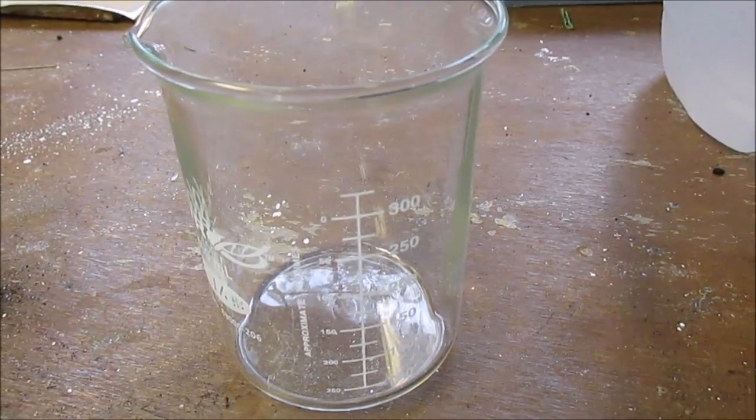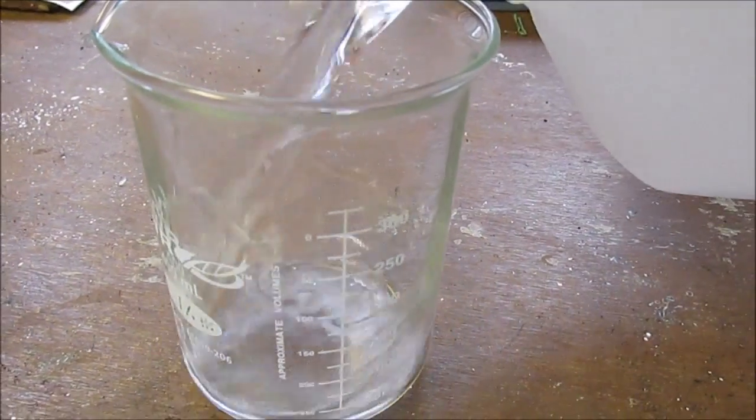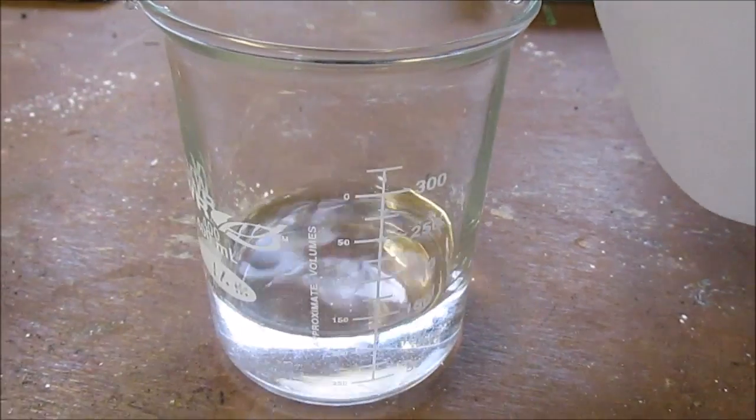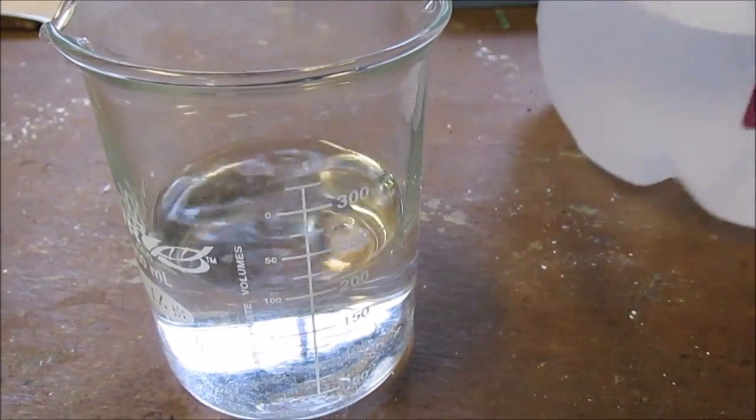Since this is an aqueous reaction, you're going to need some water. I'm just going to take about 100 mils of distilled water — actually, I think I'll go for 200 mils. Okay, a little bit more visible. There we are.